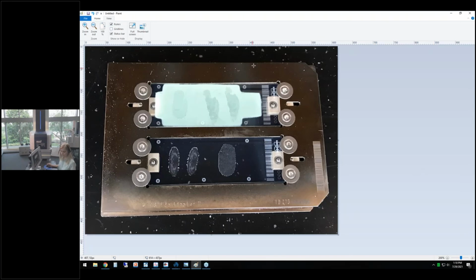Okay, so as we were talking earlier, I hope you can see now the layout of our MALDI target, with two glass slides here. It's the same one that I was holding up earlier. On the bottom we have the IntelliSlides, which are specific to Bruker.